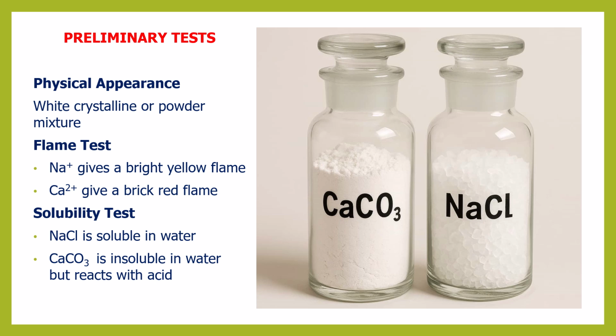All right, with this background, now let us start the main analysis. Remember, we are required to put them in equal amounts, mix them together so that they become one substance. And this substance is known as F. Let us start.